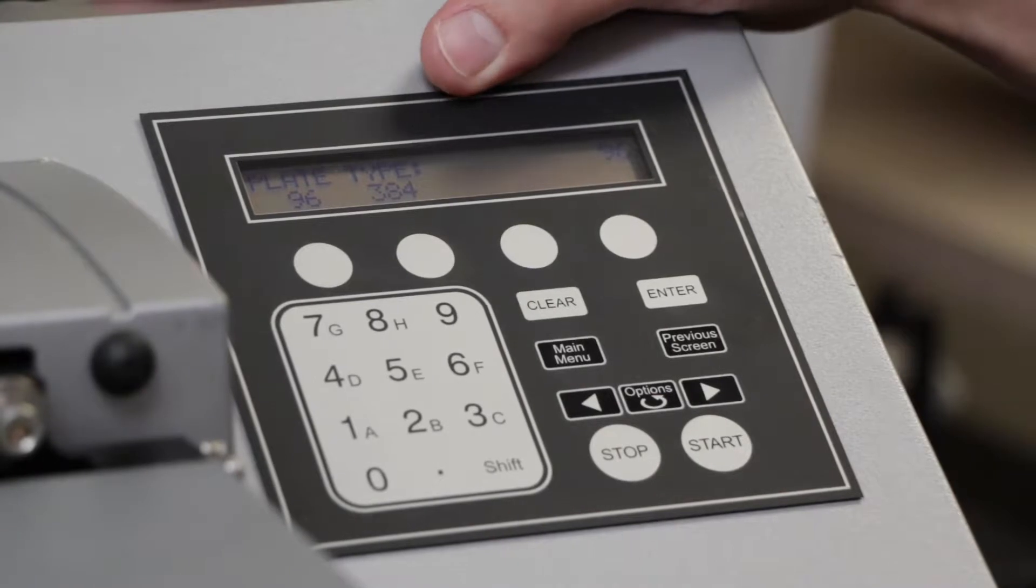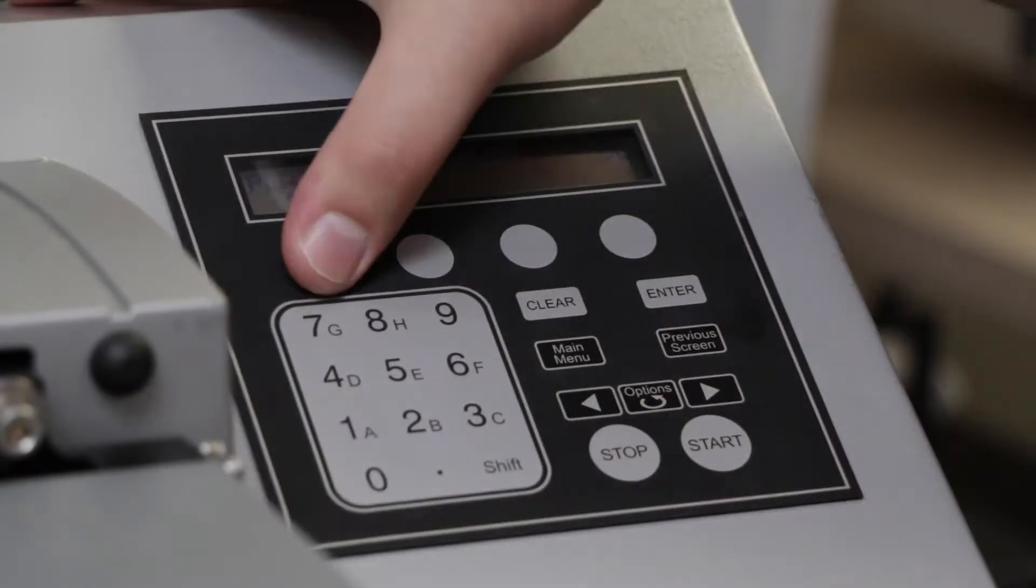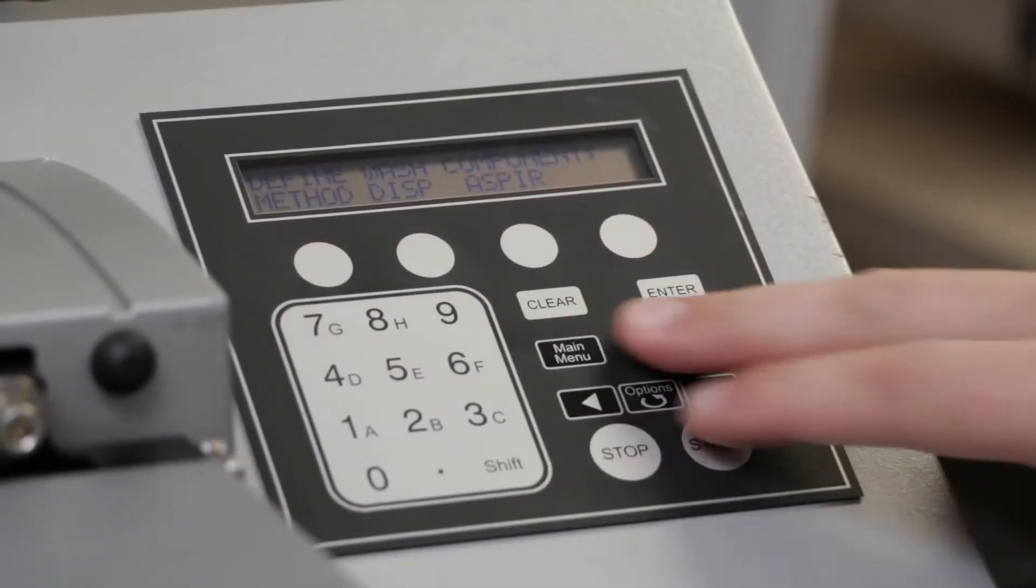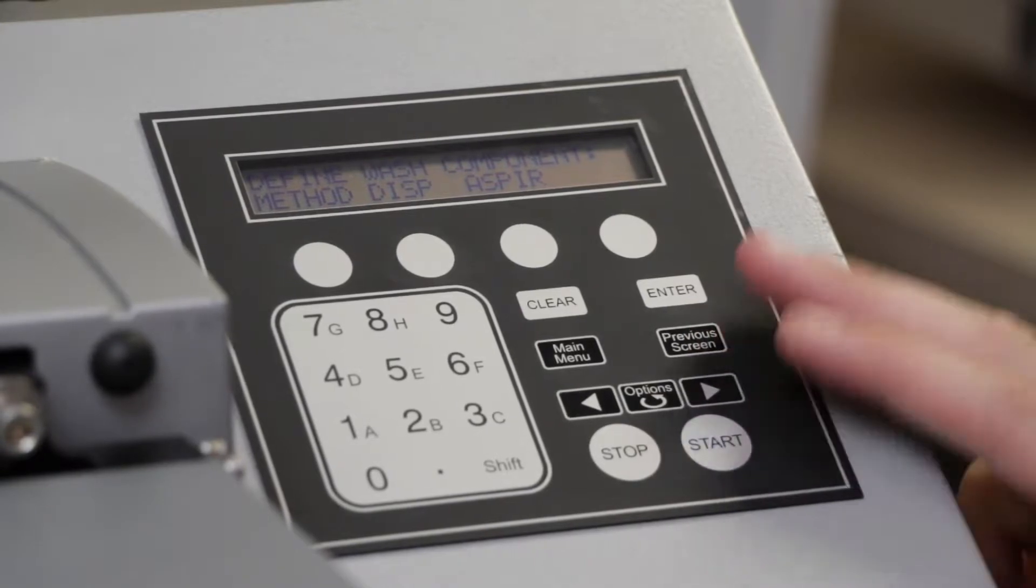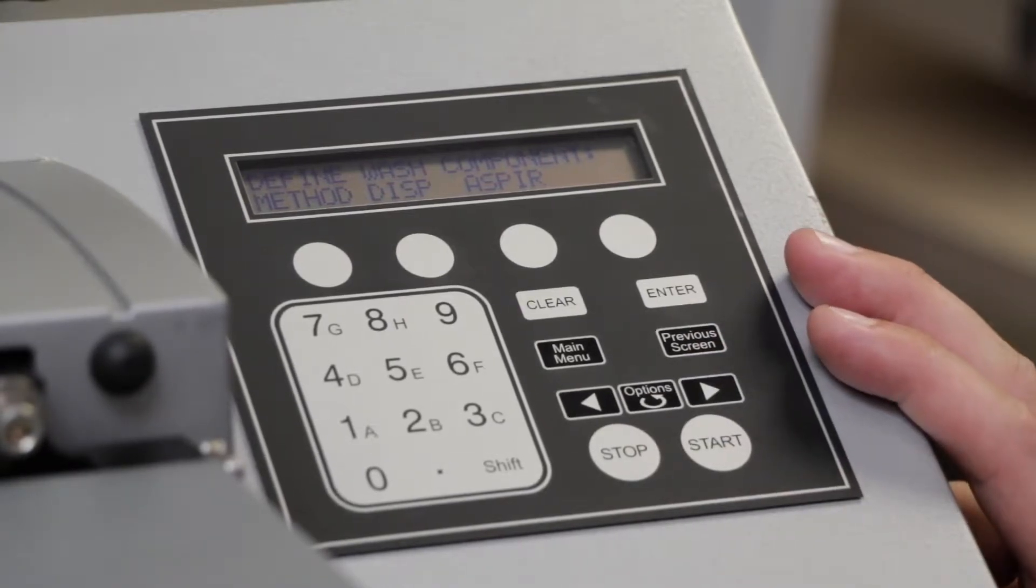Select your plate type. In our case, we'll be using a 96-well plate. From here, we can see three different options: Method, Dispense, and Aspirate.